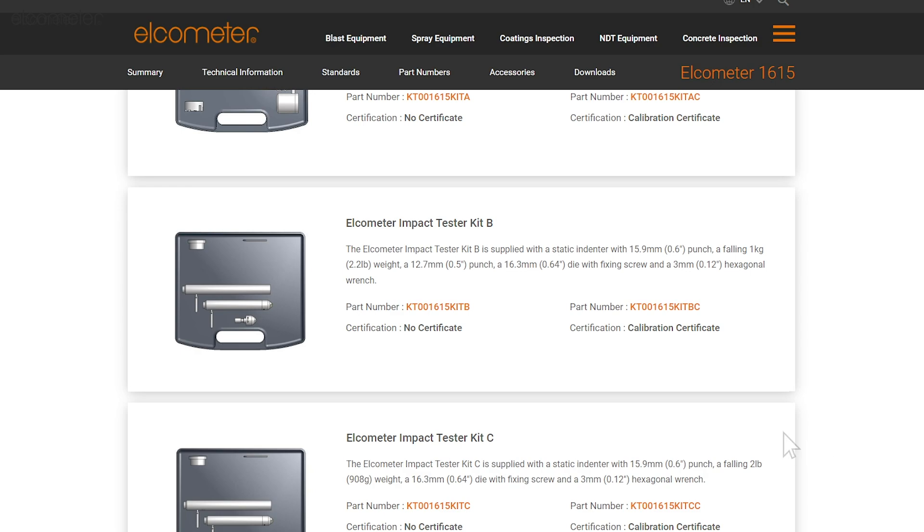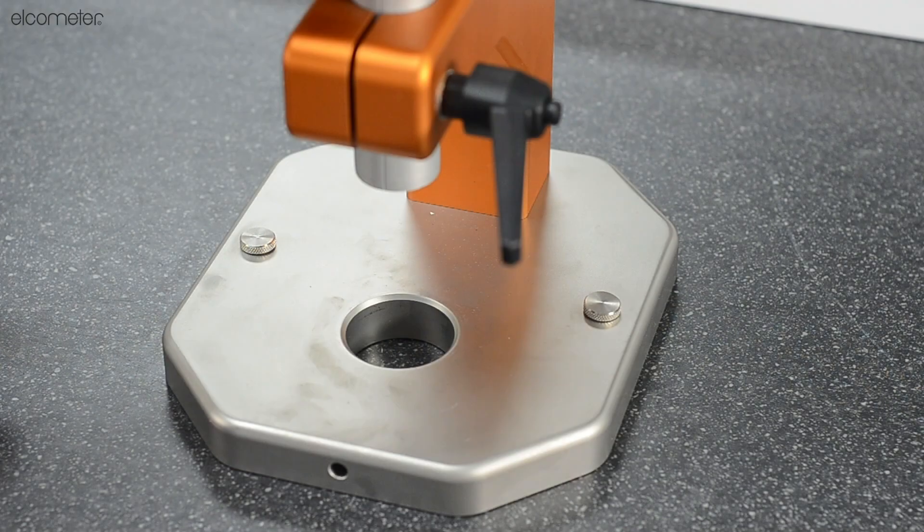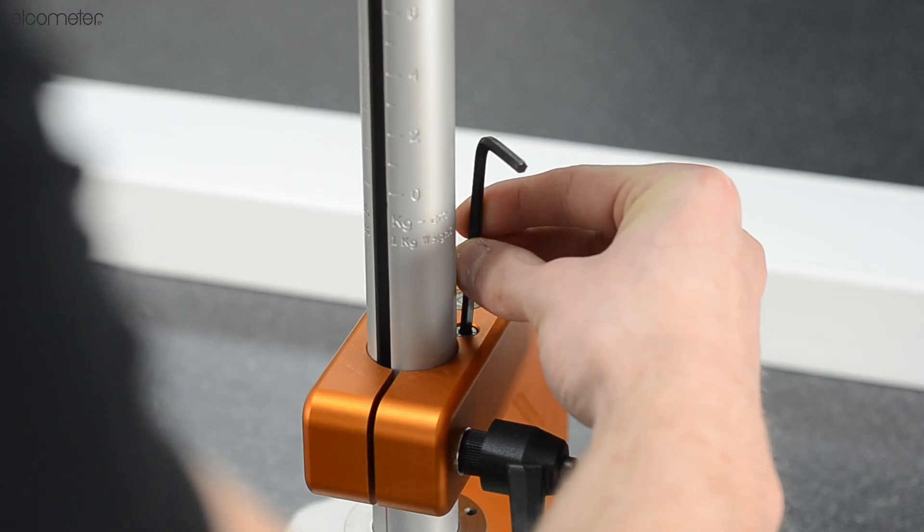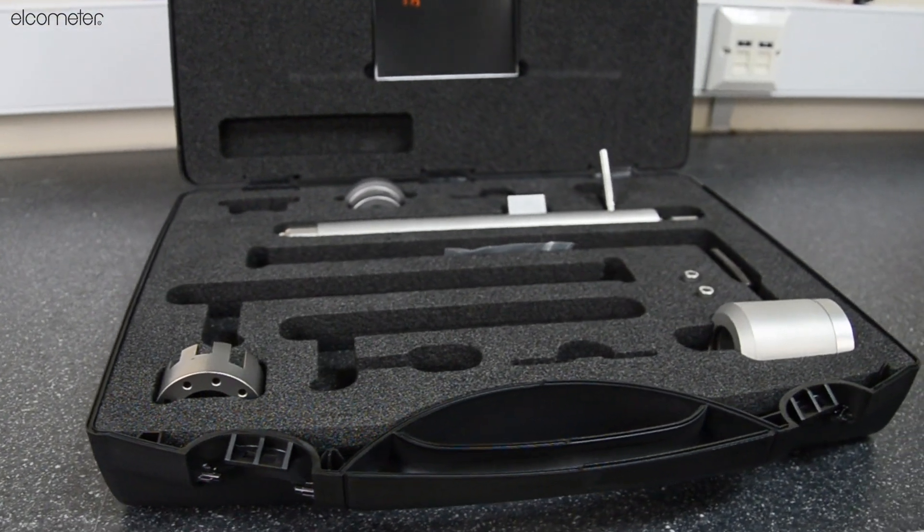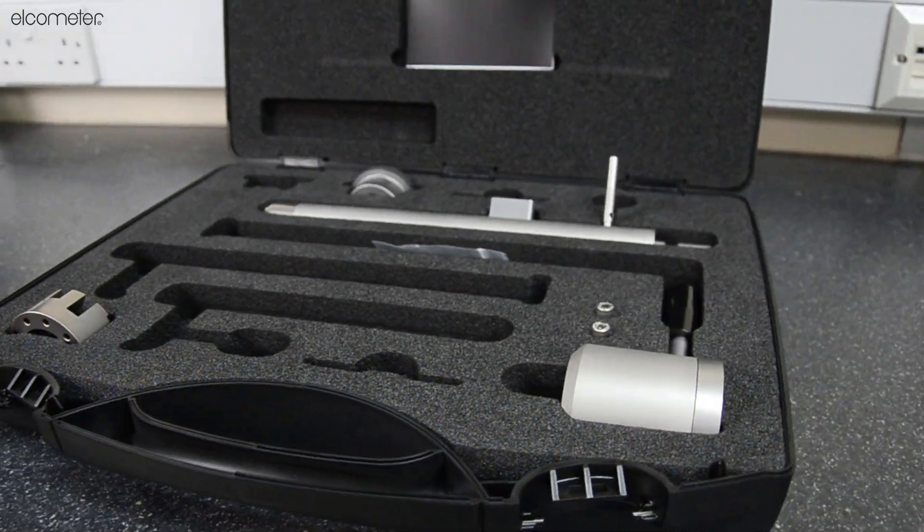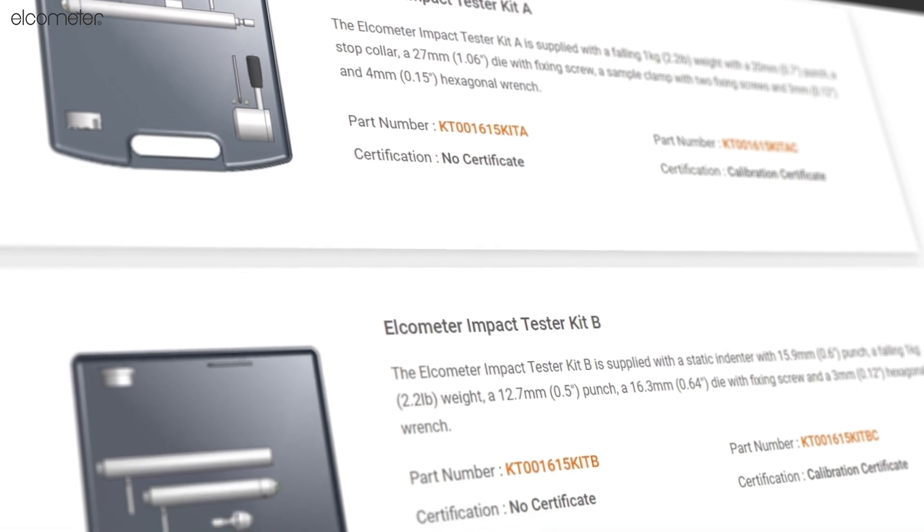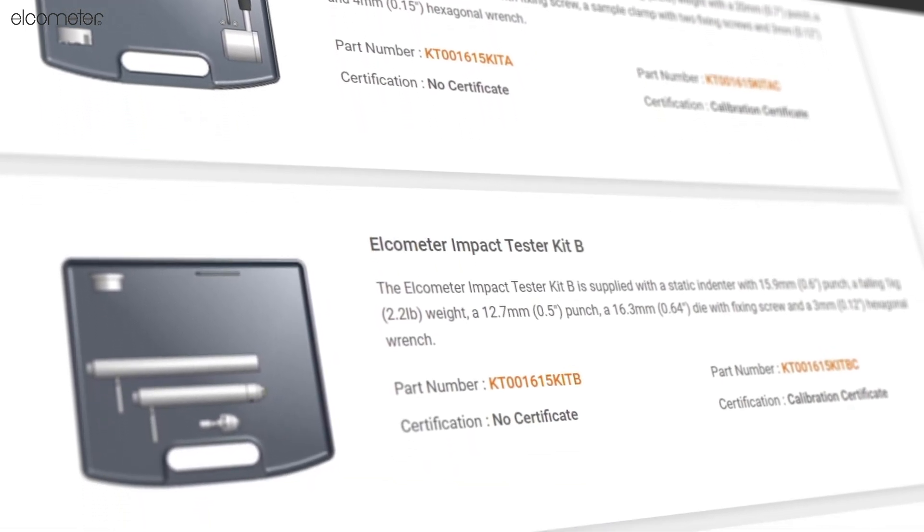Simply choose the most appropriate kit for your application, then attach the punch, die, and accessories to the base unit. For full details of the contents of each individual kit and the standards they conform to, visit www.elcometer.com.